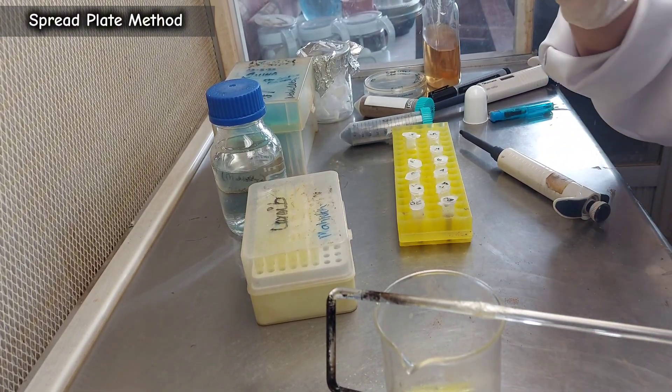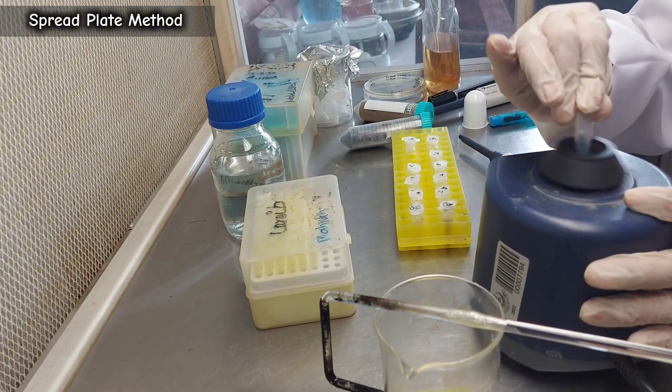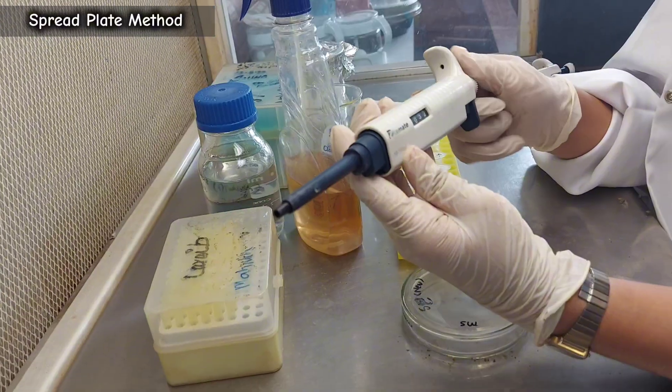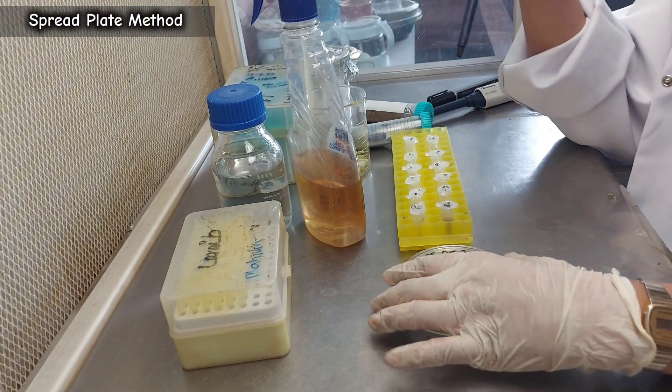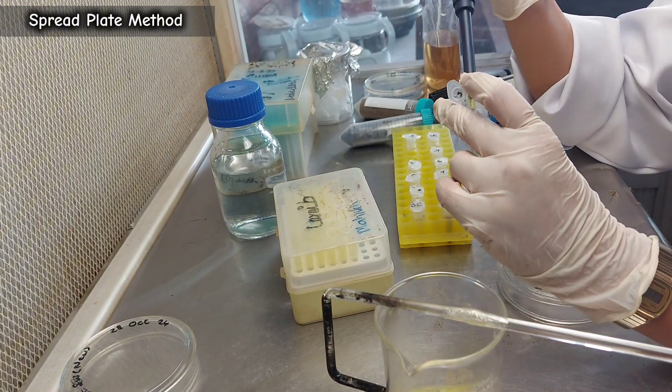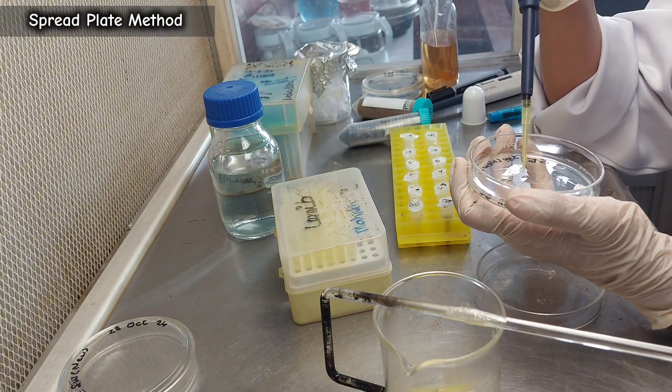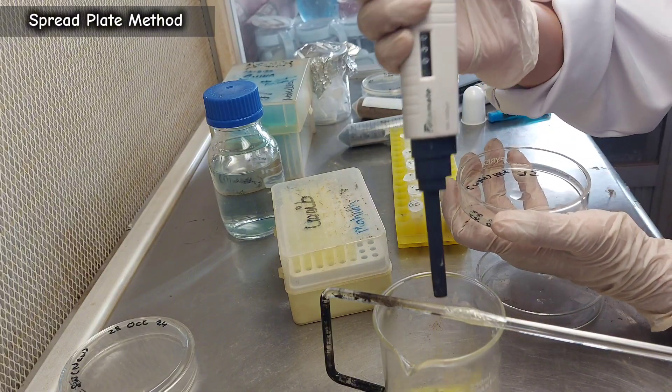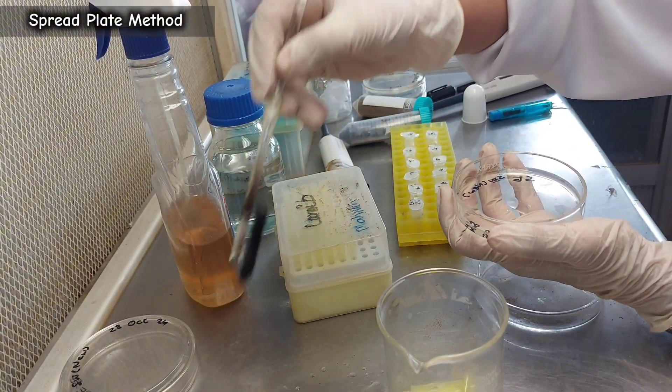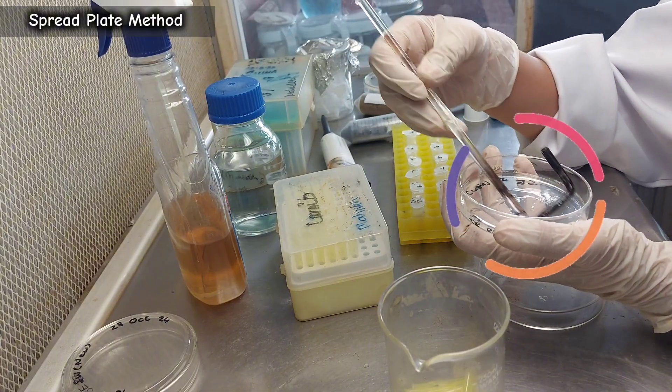Vortex the dilution tube before micropipetting. Using a micropipette, transfer 20 microliters of the dilution onto the center of a nutrient agar plate. Use the sterilized glass spreader to evenly spread the dilution across the agar surface.